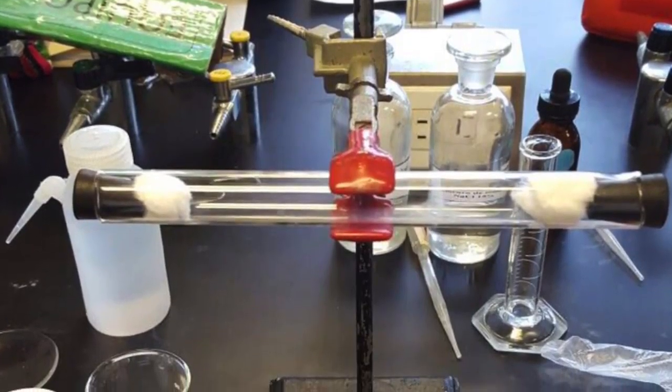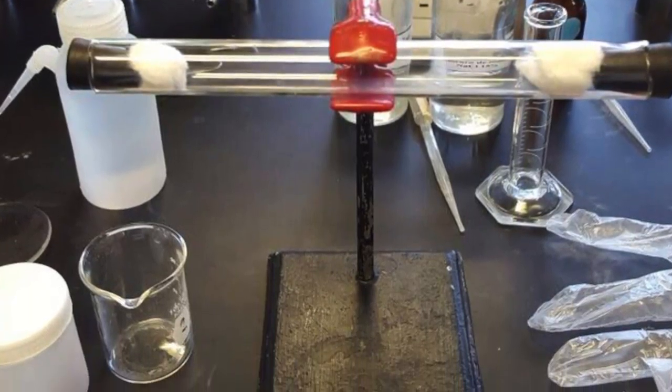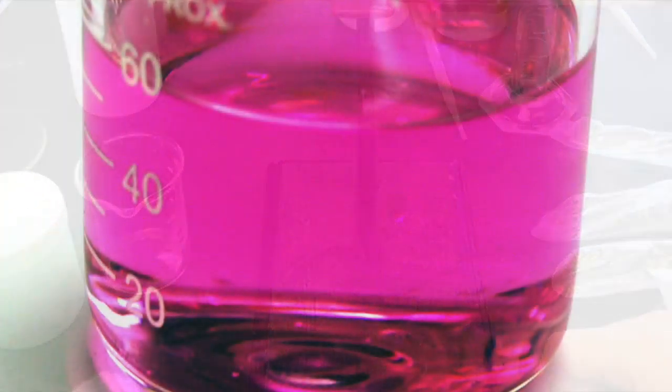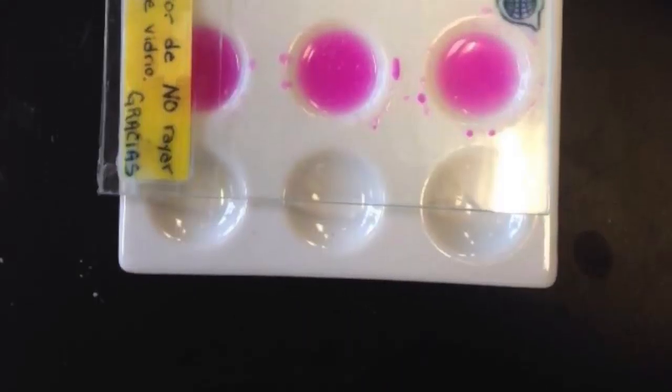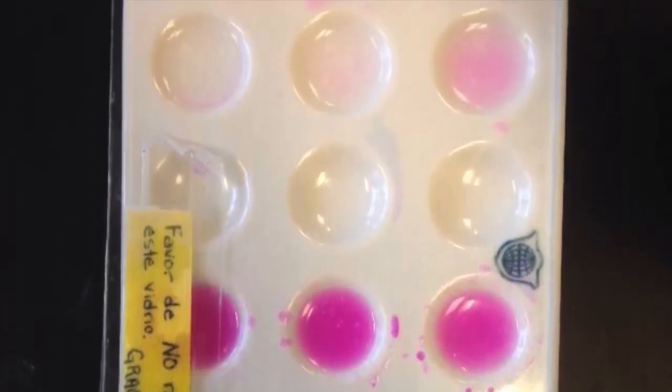On this practice, we learned how to measure density of substances and what diffusion is. We also used phenolphthalein to distinguish between acid and base. Finally, we learned how volatility affects the distance and velocity of the ring formed.